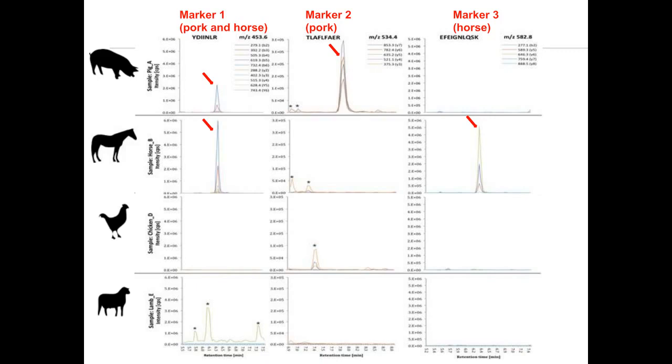What you sometimes do see, for instance, here for this lamb sample, is that you have single MRM transitions popping up at shifted retention time, so unspecific single MRM transitions, and this is simply due to the complexity of the sample. You have to keep in mind that from a complete extract from one single species, you will have something around like 10,000 proteins at least. And if you digest these 10,000 proteins, you will end up with at least several hundred thousands of peptides which elute from your column in something around 20 to 25 minutes chromatographic run. And from time to time you have, of course, a precursor ion that has very similar precursor ion mass than your peptide marker. And it might also be that 1 or even 2 of the MRM transitions also fit.